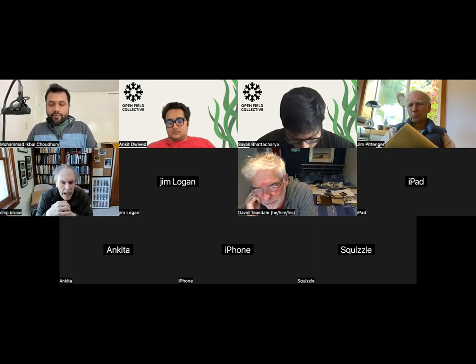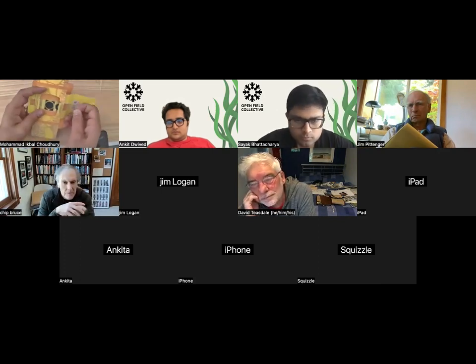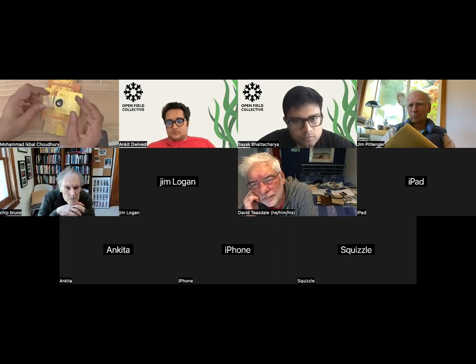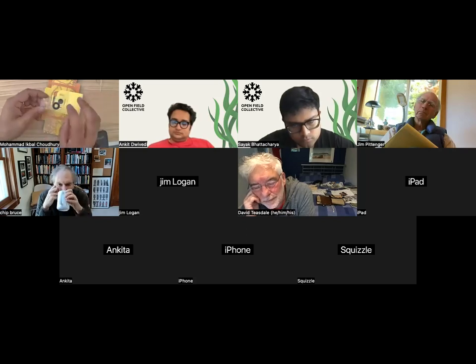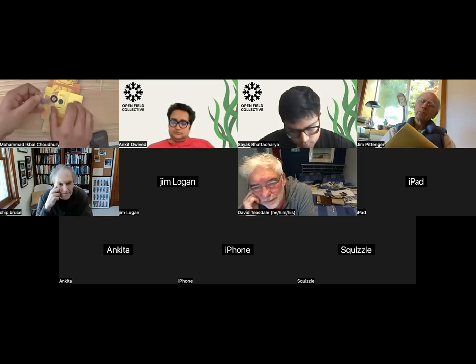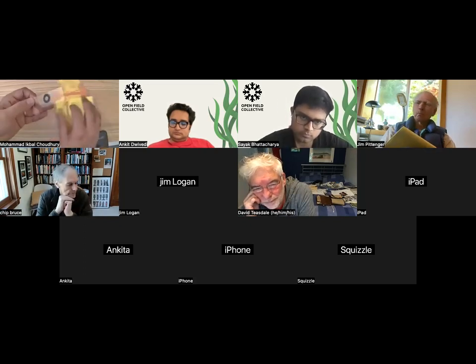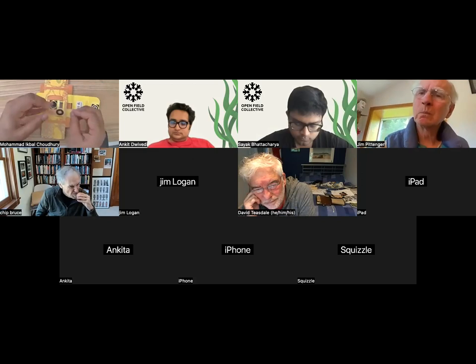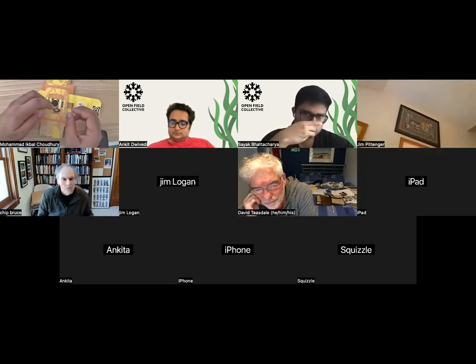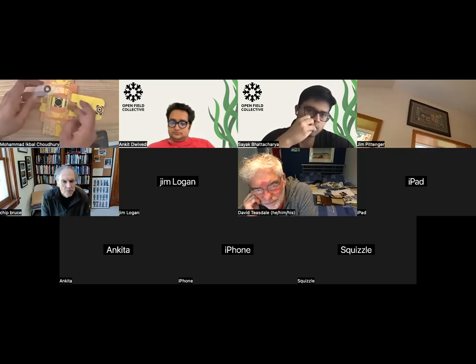Okay. Now, coming back to the repeat of the slide setup. So that's my slide, right? And it has the sample on top and nothing on the bottom. So that's plus. I try to place the sample towards the lens here. So you have the foldscope, you open the flap like that, and you try to orient or place the sample towards the lens. Okay, so the slide needs to go in like that into the foldscope.